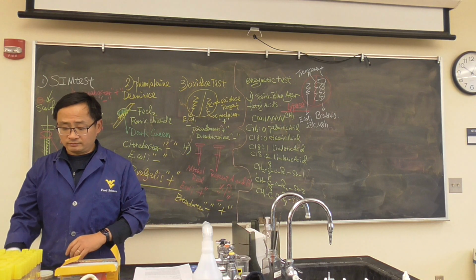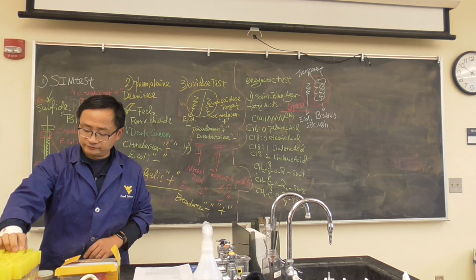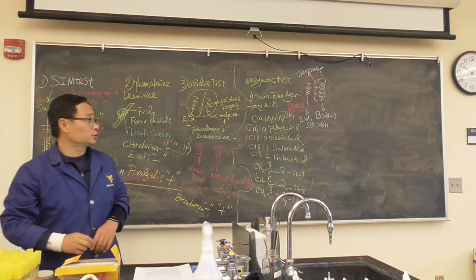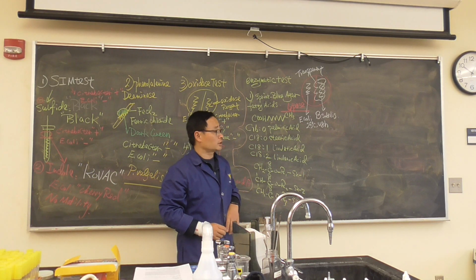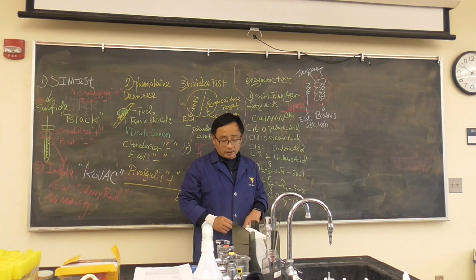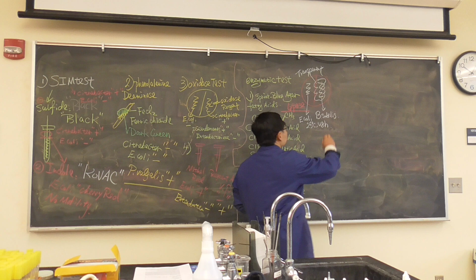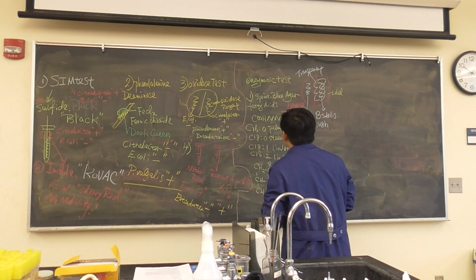It's very easy. You have E. coli, and then you also have Bacillus subtilis. The agar is split into two. Left side inoculate E. coli, right side inoculate Bacillus subtilis. Now, of course, you have to do the label by yourself. Okay, don't forget the label. So that's the first test.